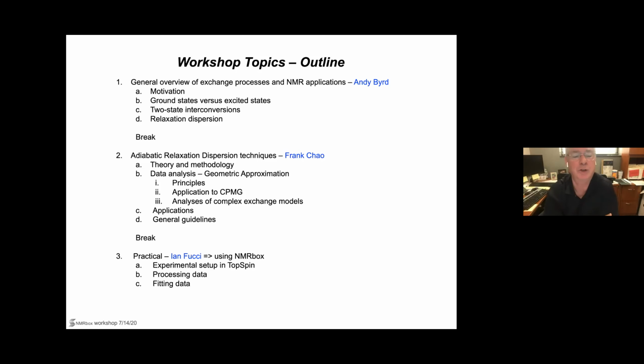I think what Frank will show you is that you have the potential to now start expanding, I just mentioned it briefly, to other exchange topologies and how you do that. Then things get complicated, and you always have to be sensitive to experimental error and how much error you have. But I think in general, in traditional two-site analysis, it's equally as good to do this, and you'll get the same kind of sensitivity to populations.